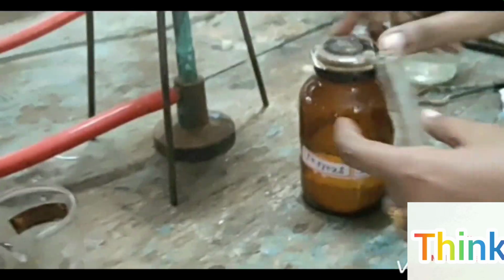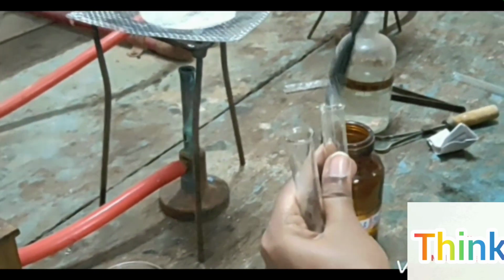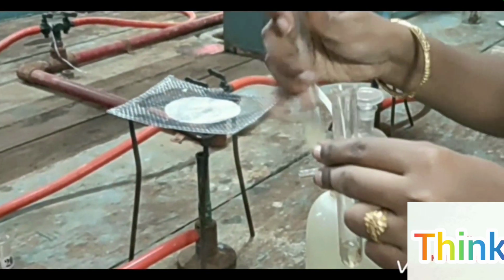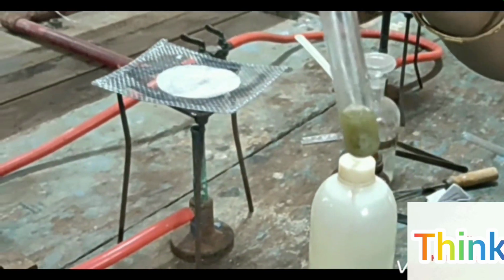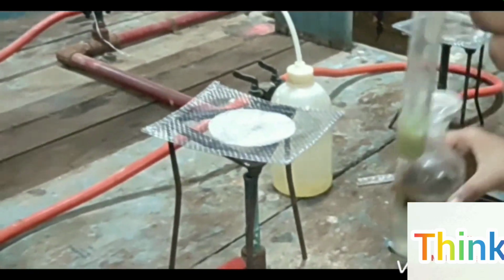We can take a small amount of sodium extract and ferrous sulfate solution. So we have to make a freshly prepared ferrous sulfate solution. For that, I take a small pinch of ferrous sulfate and add distilled water to make ferrous sulfate solution. So after formation of ferrous sulfate solution, I introduce it into the sodium fusion extract, which forms sodium ferrocyanide, which is green in color, but the reaction isn't finished.